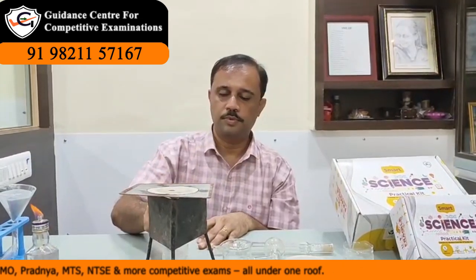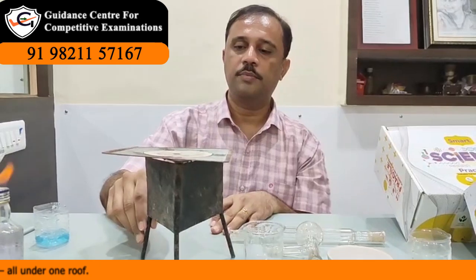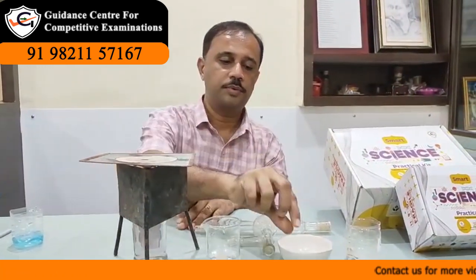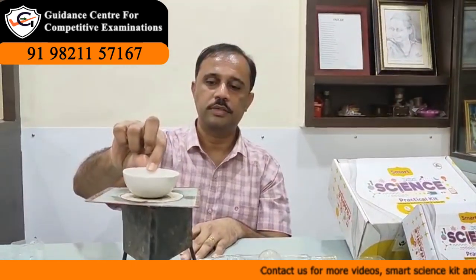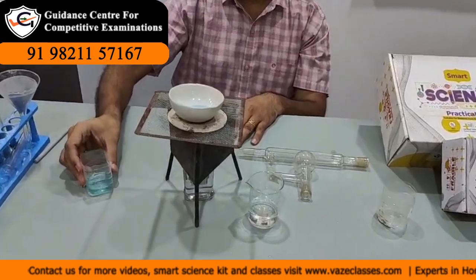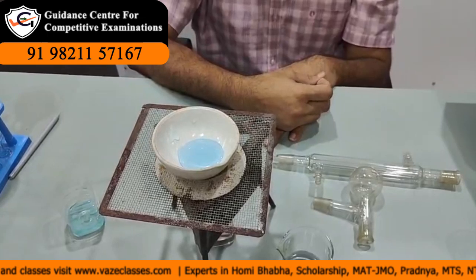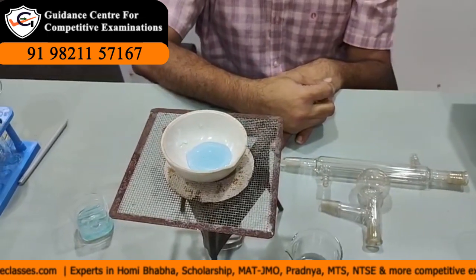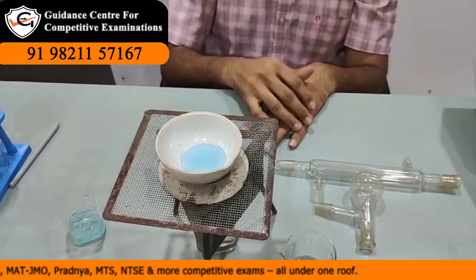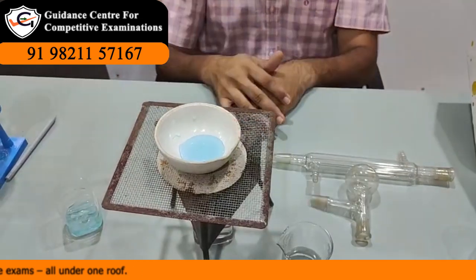Let us make a setup for evaporation. This is a wire gauze kept on a tripod stand. This is a spirit lamp and an evaporating dish. We will transfer some amount of filtrate in the dish. After some time it will evaporate, leaving behind crystals of copper sulfate. The solvent, that is water, evaporates, so we will not get the solvent back. We get only the solute back in evaporation.